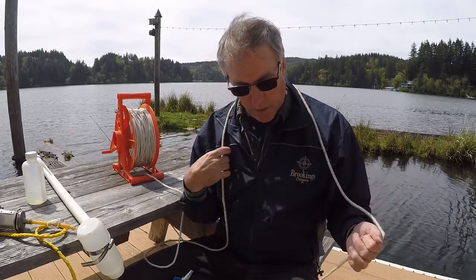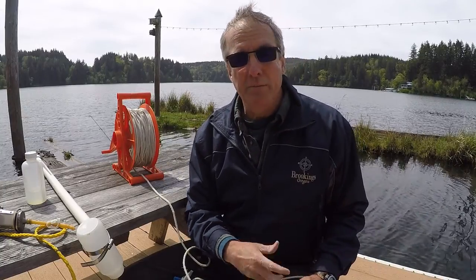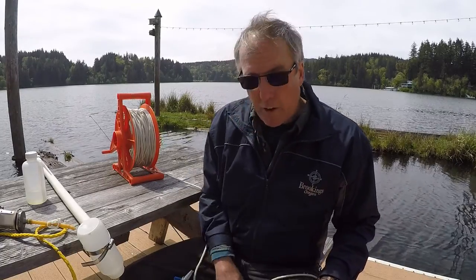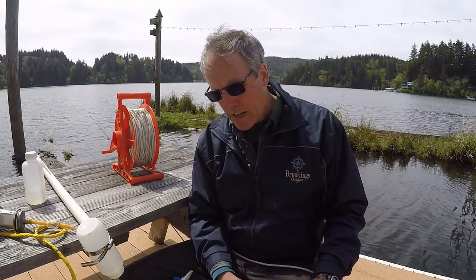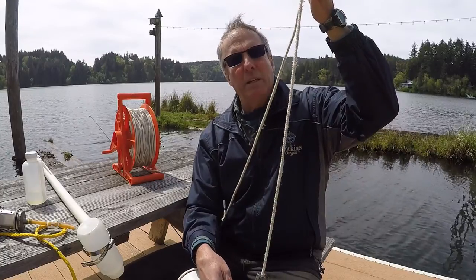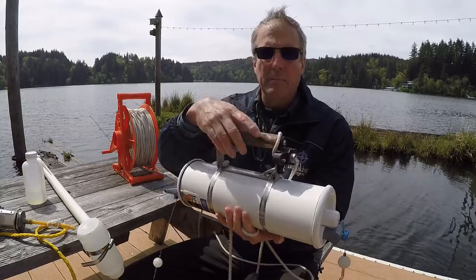So now the water that's within this is from whatever depth the rope was when we let it go. So we can measure the rope to find out how deep if we need to, or a lot of times we don't even care the depth that much, and we may want an estimate of it just for our knowledge, but a lot of times we just want it half a meter up above the lake bottom. So there's a little bit of a trick just in getting that half meter right. When you're lowering it down, you don't know exactly when you're going to hit the bottom, so eventually this will go down and it'll hit the bottom.